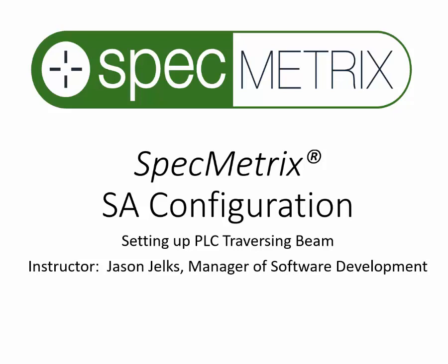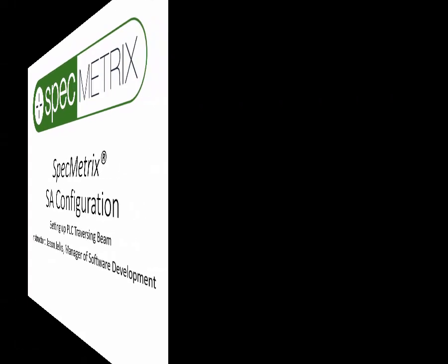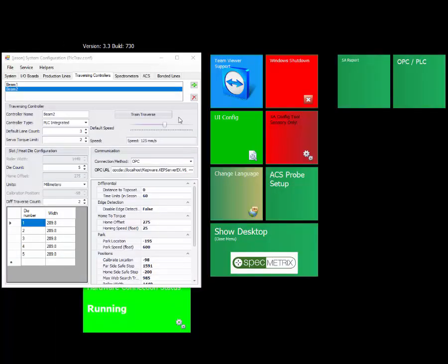In this video series, we are going to discuss setting up the SpecMetrix system using the SA configuration tool. Starting in SA 3.3, we have simplified the process for configuring a SpecMetrix traversing beam.